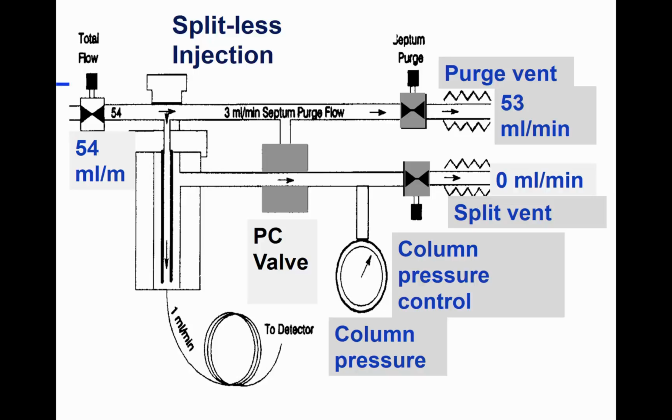And so we've got to clean it out. So we let it maybe run 1 minute and suck everything in there we can. After 1 minute, then we change our flow. So now we're cleaning the system out, and we've got a nice clean injection port. Our injection's done. Again, if that doesn't make sense, you can ask Cindy and have her explain it to you when you're doing the lab, or stop by.